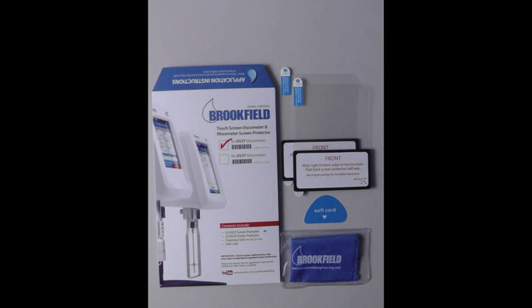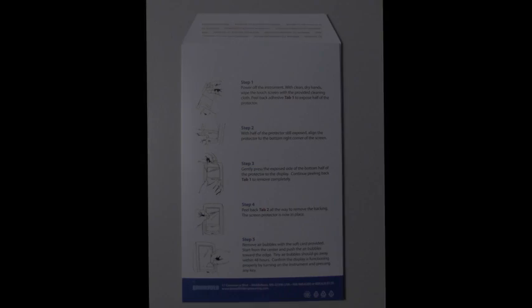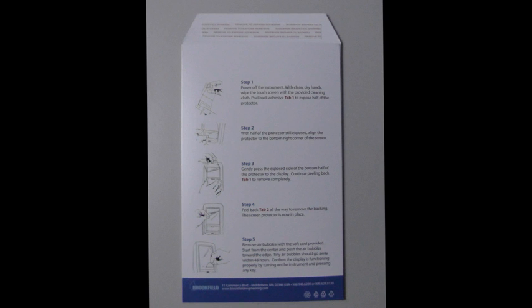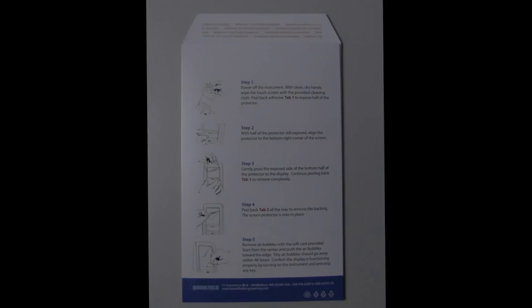Brookfield Engineering offers screen protectors for our new DV2T viscometer. Before you apply the screen protector, make sure you have read all of the instructions carefully.